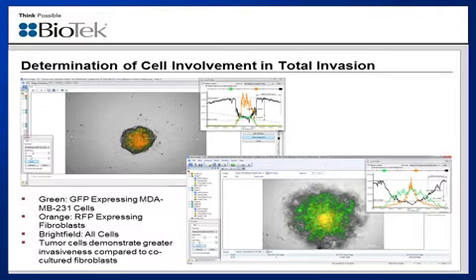With the use of the line profile tool, we can draw a line from one side of the image to the other through the tumoroid structure. And the Brightfield or fluorescent signal captured from each channel within each pixel is then plotted in the graphs that you see here, from the tumoroid on day 0, and then here from the tumoroid on day 5.